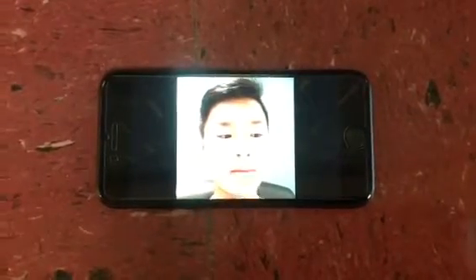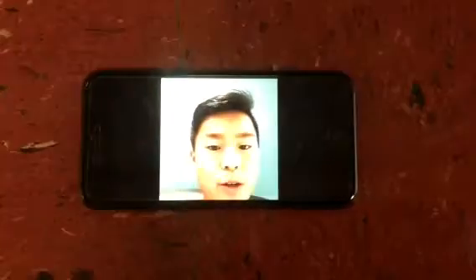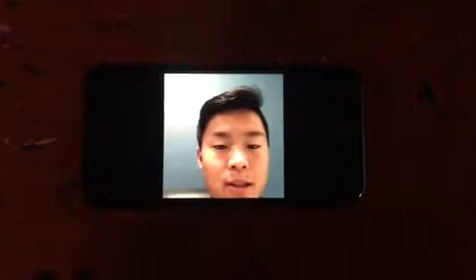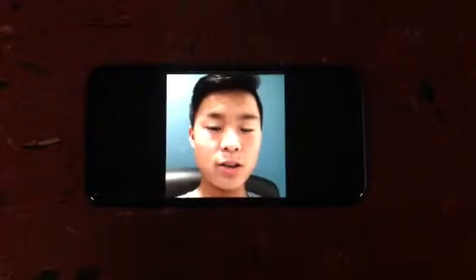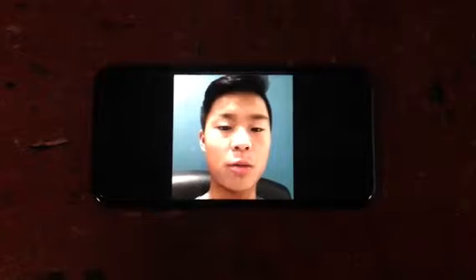Hi, in this lab we aim to separate a mixture into pure substances. In this lab we use decantation, extraction, recrystallization, crystallization, and filtration. We were able to separate these substances through their different polarities and their solubilities in water. For example, sand is not soluble in water, while salt is. We also separated benzoic acid in this experiment, which is slightly soluble in water, but only to a certain extent.